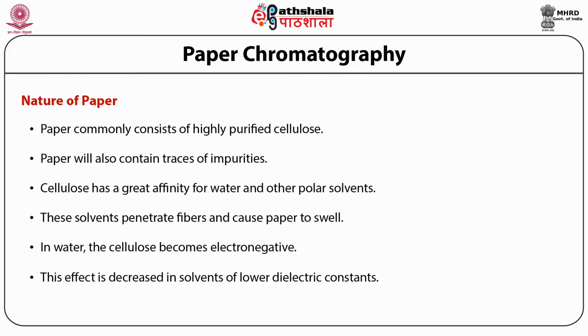Most of the properties just described vary from paper to paper, even within the same lot. Acid washing, rinsing, and drying help in obtaining reproducible behavior, but at best, variation in RF values can be expected.